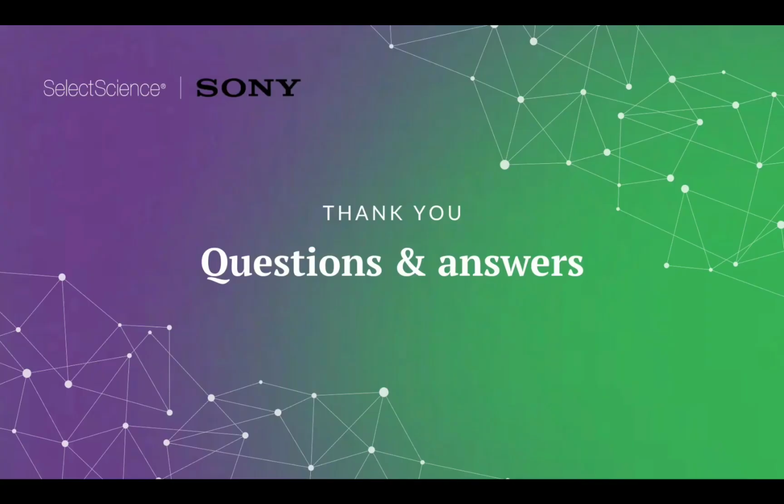Oh, this is an excellent question, and I'm glad someone brought this up. The answer is, it depends on the instrument. What I can say is that on the ID7000, the system adjusts spectral data across different voltage settings, allowing you to reuse stored spectral references even if your sample is acquired at different voltages.